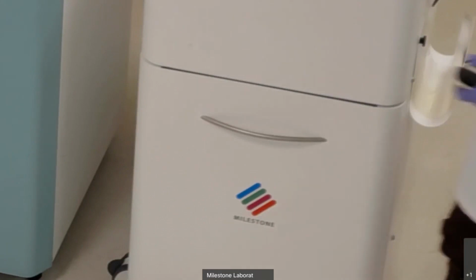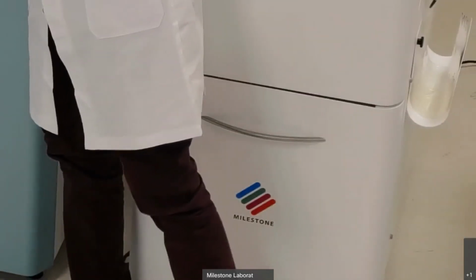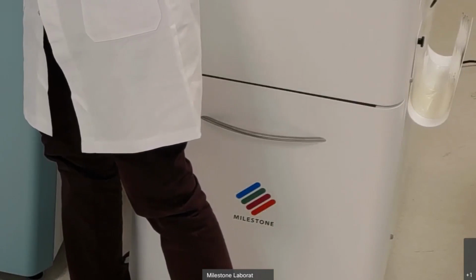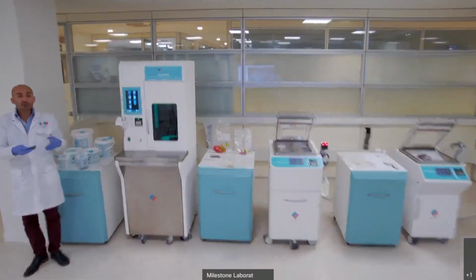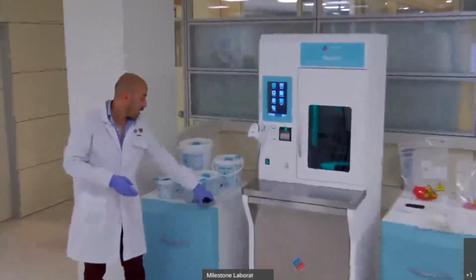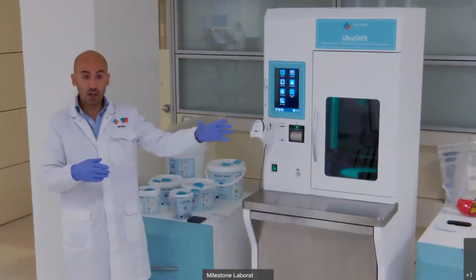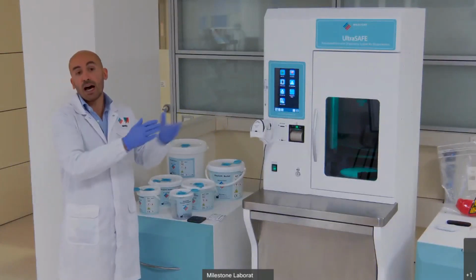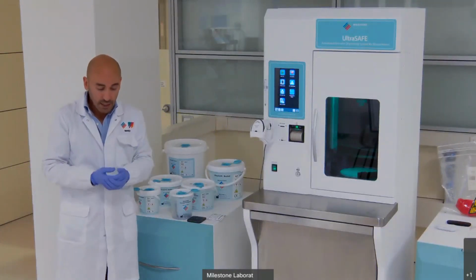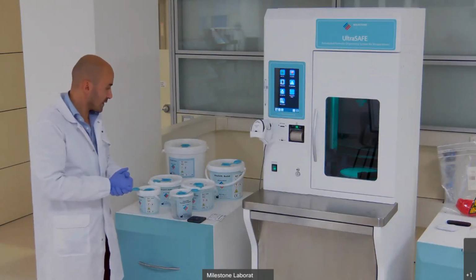We move now towards the third part of this presentation. And I need to go back to the previous camera. Once we get the principle of documentation, traceability, and safety for the previous two instruments, the same principles are made for ultrasafe. So therefore, it's really intuitive even to work with ultrasafe.